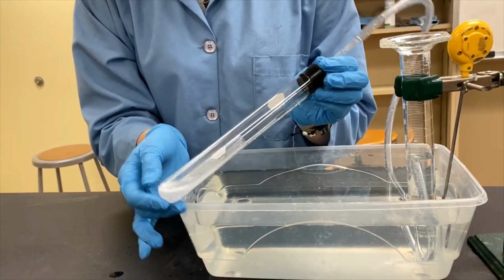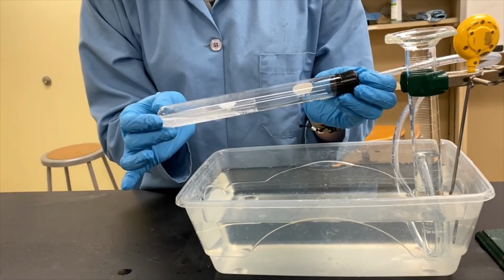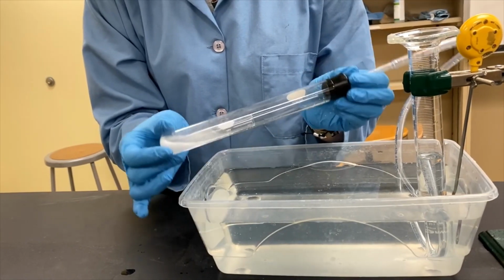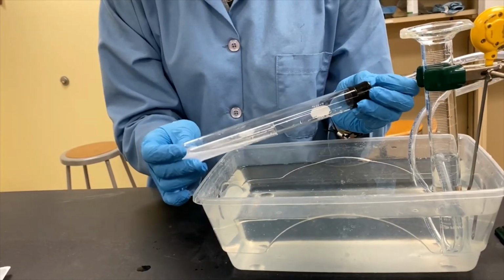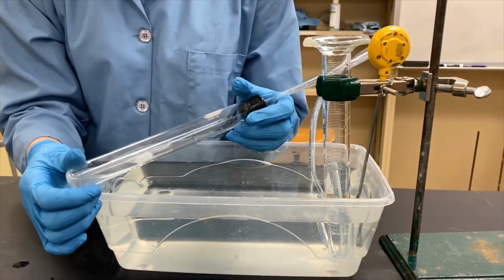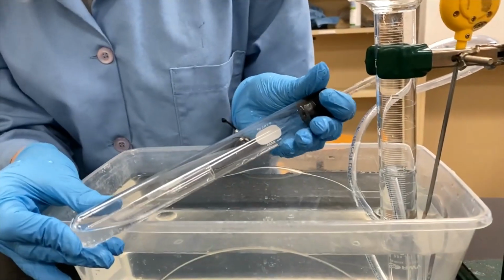And essentially, if you can't see that the calcium carbonate is not dissolved, you can know that the reaction is done when the bubbles have stopped. So we still have a little bit.